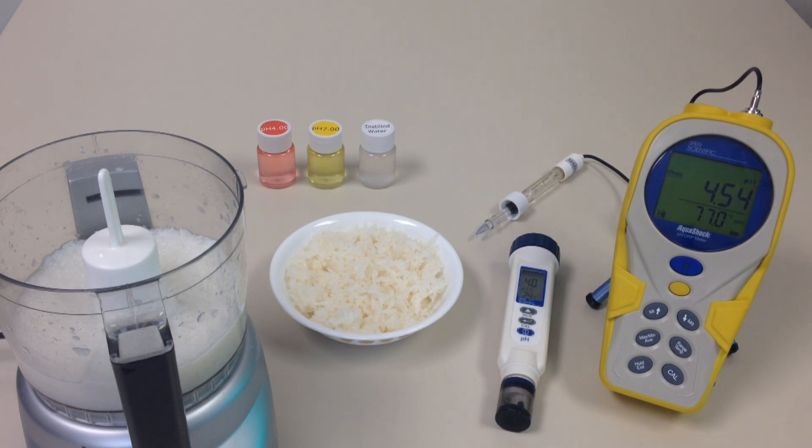We've got two different pH meters to show you. One is our AquaShock, which is a handheld, shock-resistant, waterproof pH meter, which would be perfect for a kitchen environment. The other one is one of our pH pins, which is also waterproof and drop-proof, and it would also work very well in the kitchen.